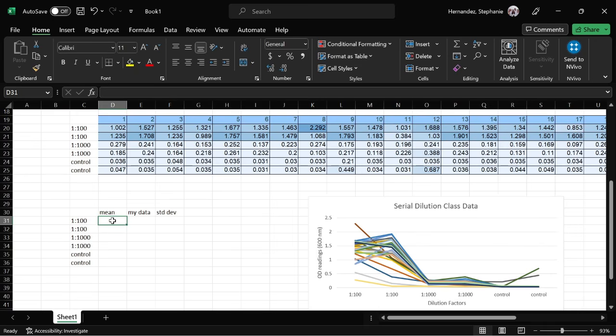So for the mean, how you find means is you're not going to individually be plugging this into a calculator with this much data. It's just unrealistic to do so. So we're going to utilize Excel's function feature to do the work for us. So the way you do that is you just put an equal sign, then that is kind of telling Excel, calculate whatever I want for me.